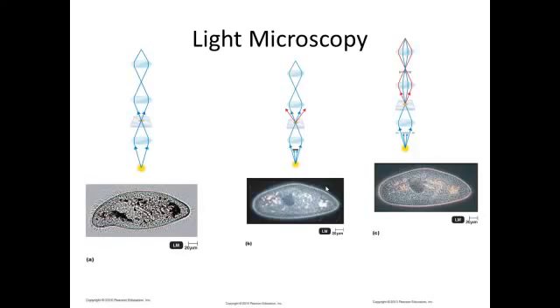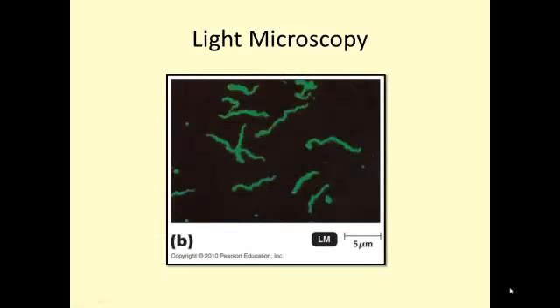So it has a tendency to be used in situations where you wouldn't want to risk a very expensive phase contrast microscope.